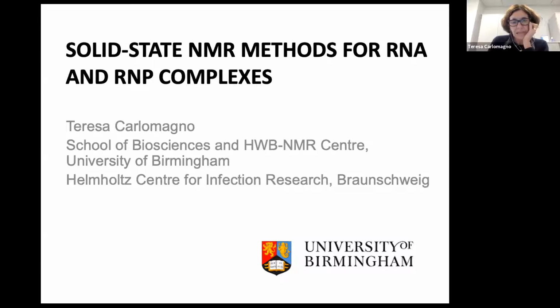But the research that I'm talking to you about was done first at the EMBL, where we started moving into solid state NMR spectroscopy, and then continued at the University of Hannover, where I've been for the past 6 years. So first of all, let me give you a reason why a solution state NMR spectroscopist would want to move to solid state.